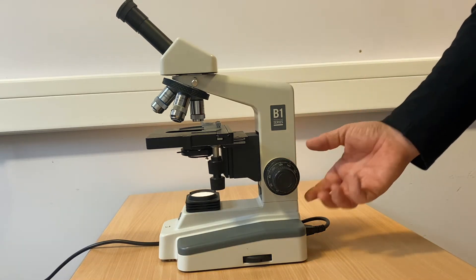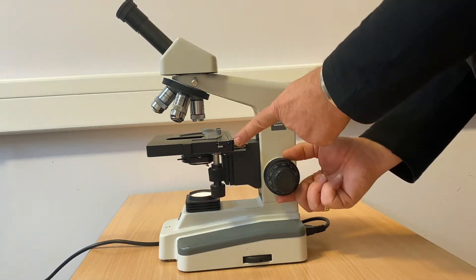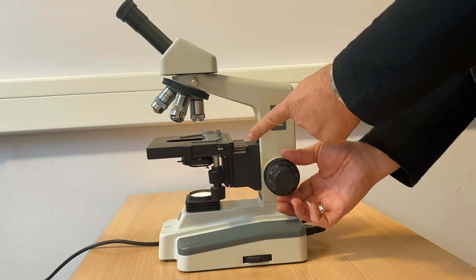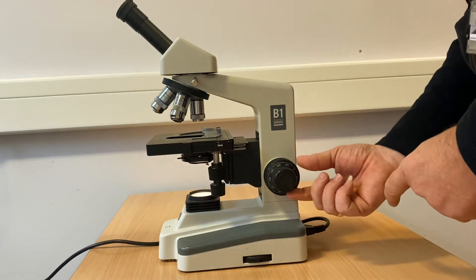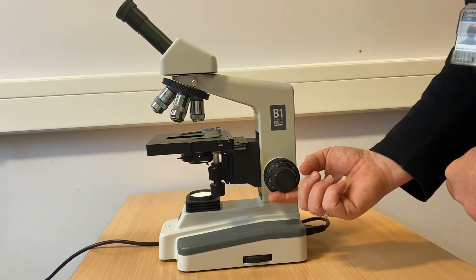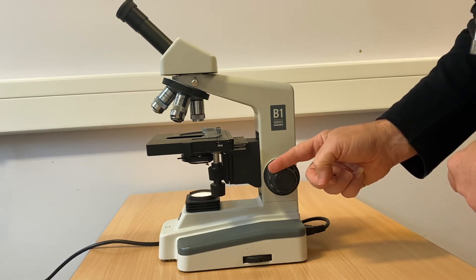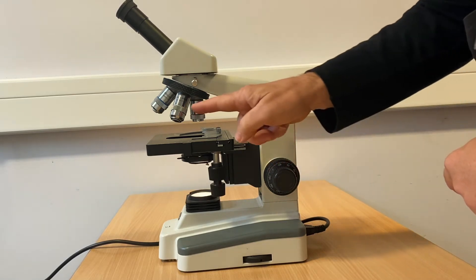The microscope is focused by a two-stage wheel at the side of the machine. The outer wheel controls the coarse focus and moves the stage up and down in large increments, whereas the smaller inner wheel controls the fine focus and moves the stage very gradually to achieve fine focus through the width of a slide.